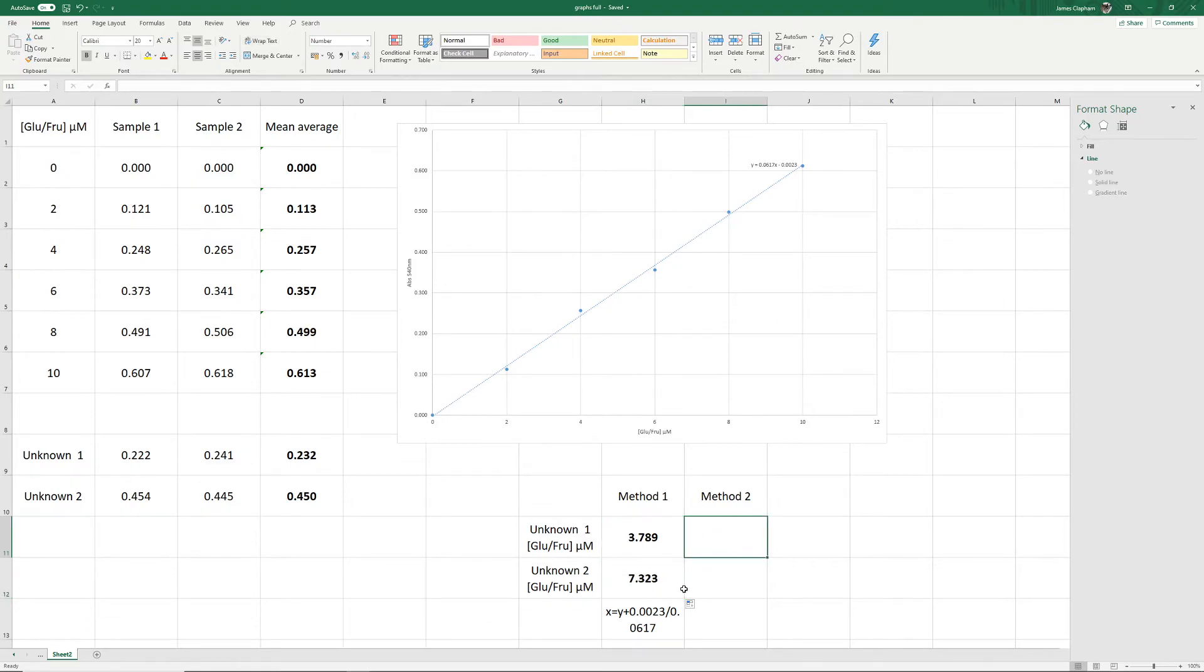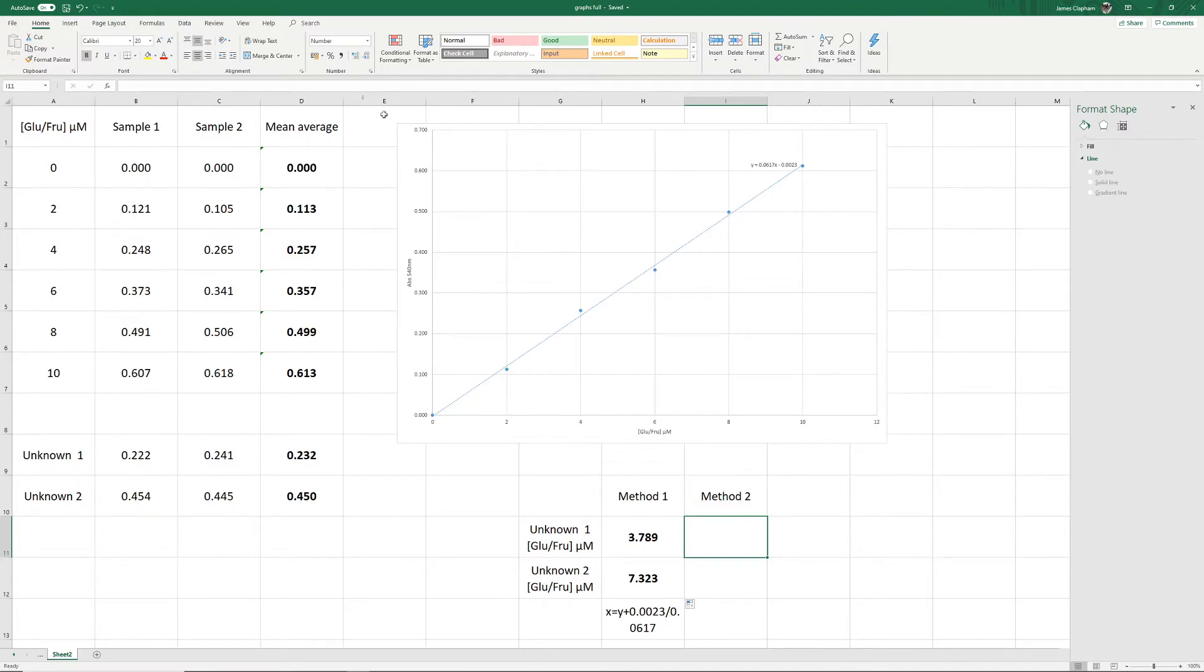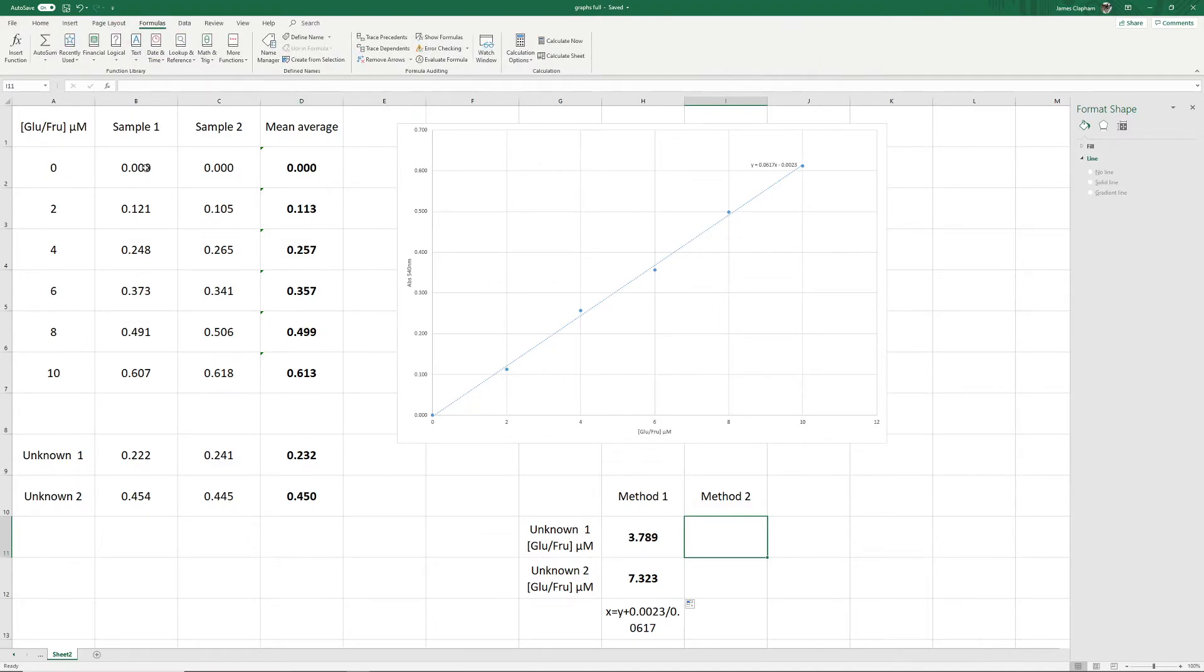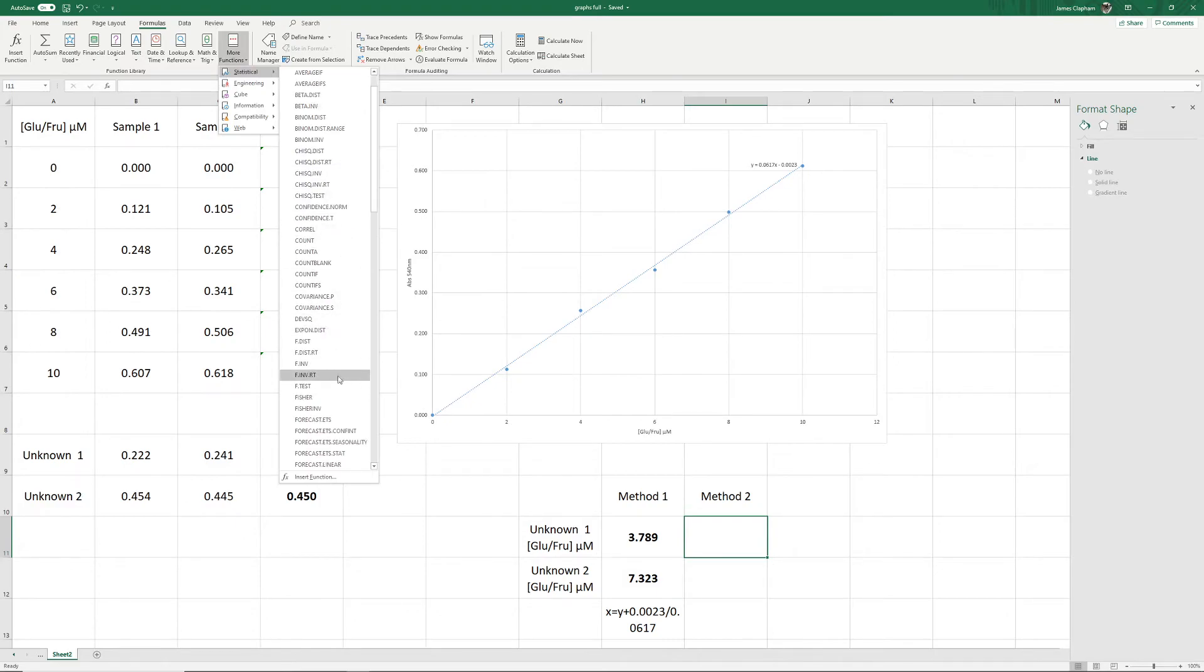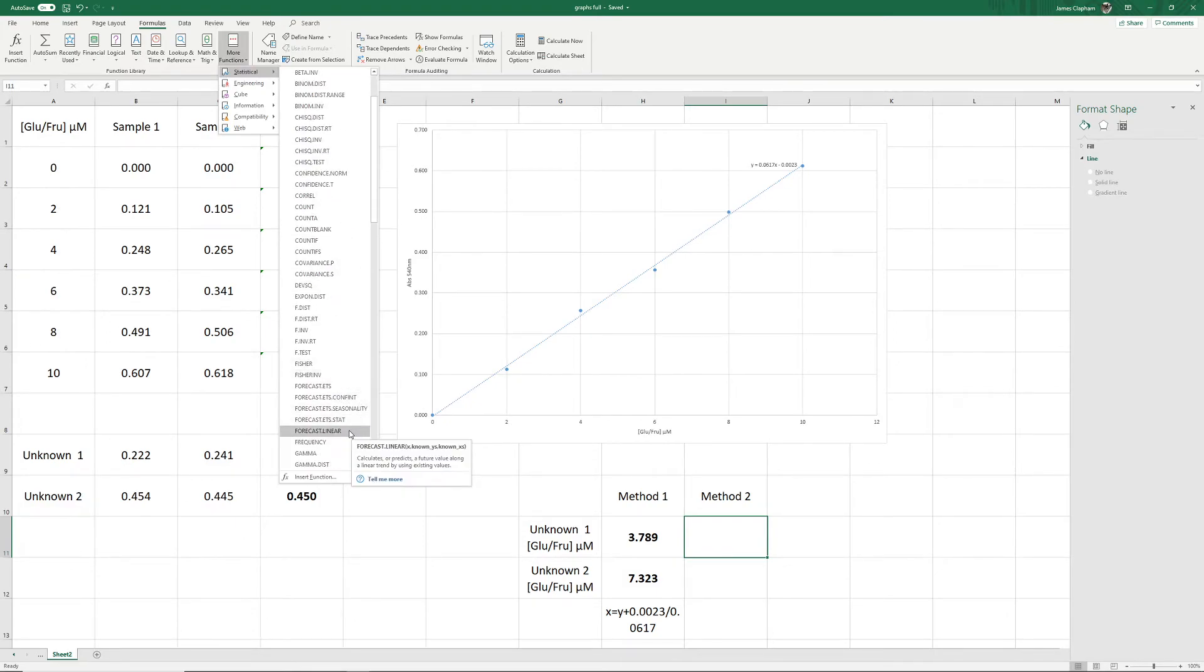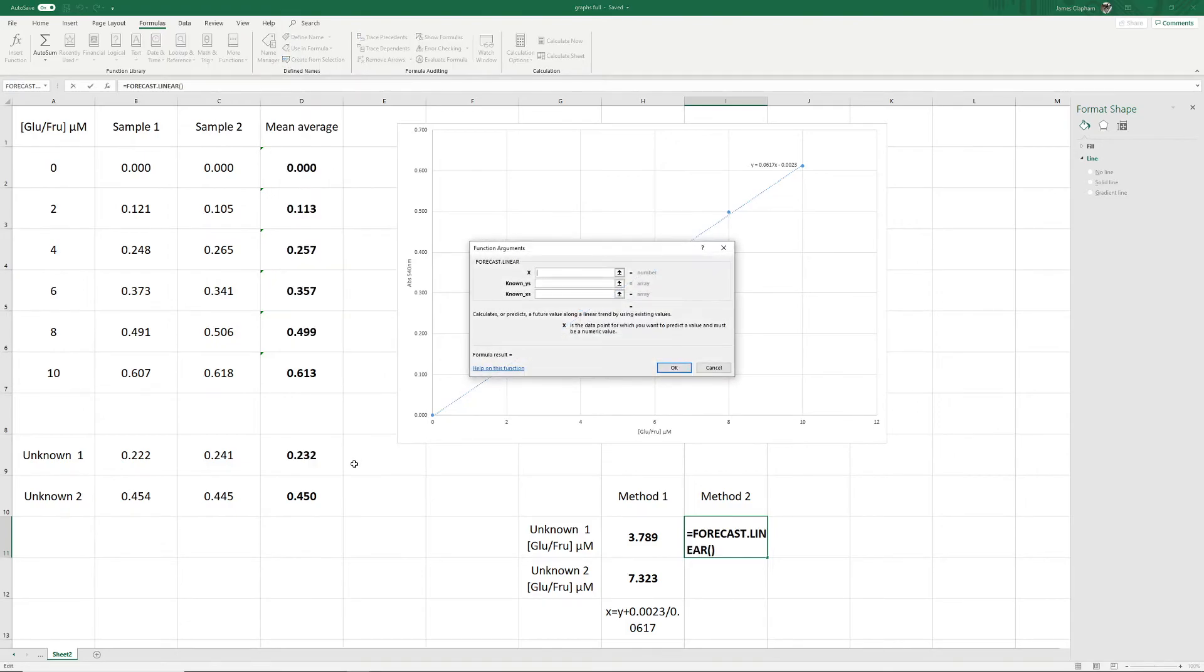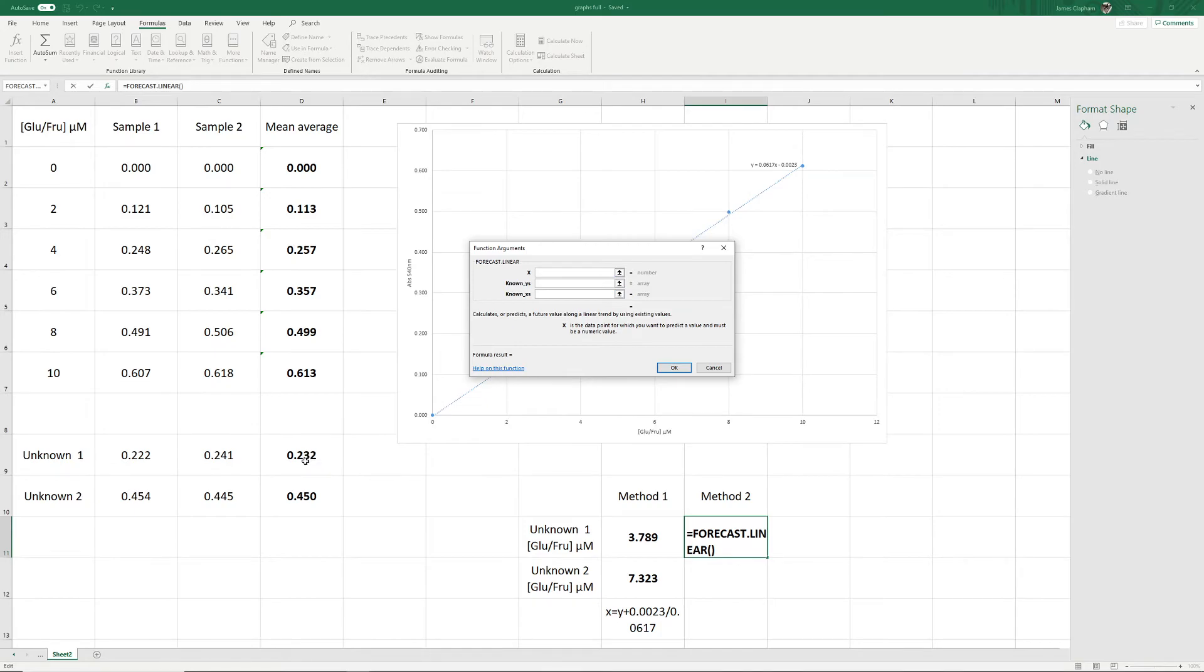The other way you can do it is you can use a formula to calculate the unknowns without using a graph at all. To do this, we're going to go to formulas, and we're going to go to more functions, statistical, and then go down to forecast linear. It now wants me to put in the values to make this calculation work. So X will be our unknown. In this case, 0.232.